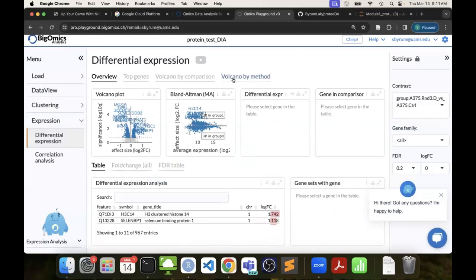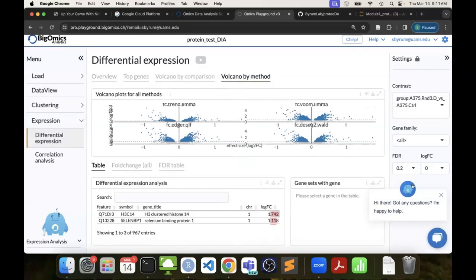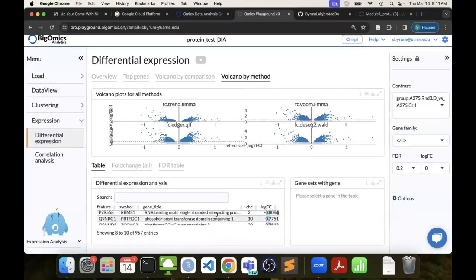They actually run multiple analysis methods in here, not just one. So this one's got Limma, Wald's test, EdgeR, some different options. What's nice about that is in the table, you would actually find proteins and they have a star if it's found in all of the methods or not. So you kind of get this consensus of what proteins are going to be important regardless of what method we're throwing at it. So that's a really nice feature.